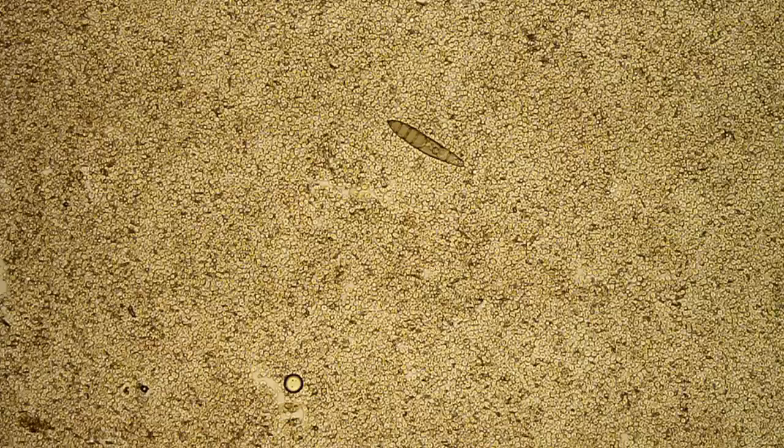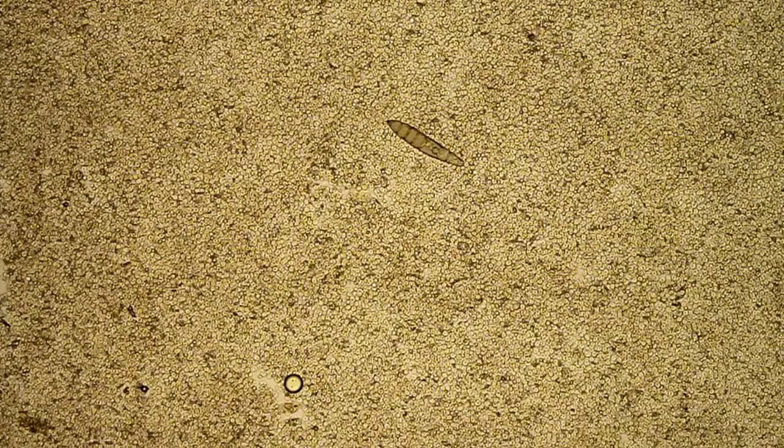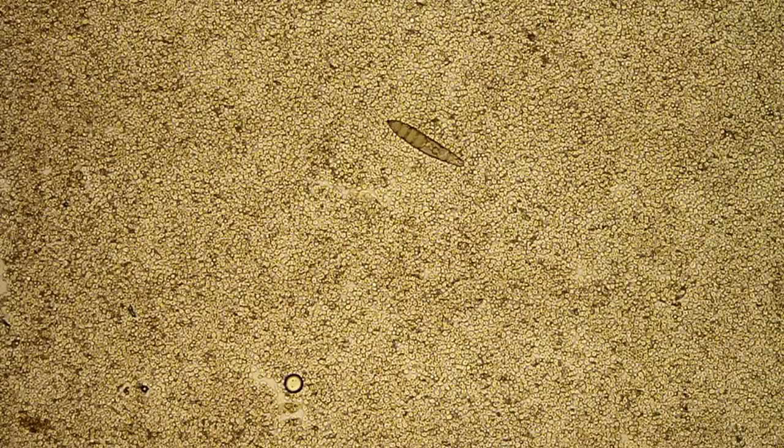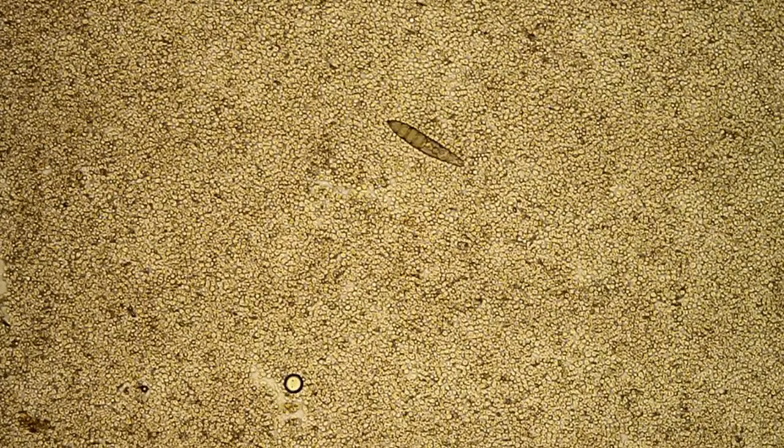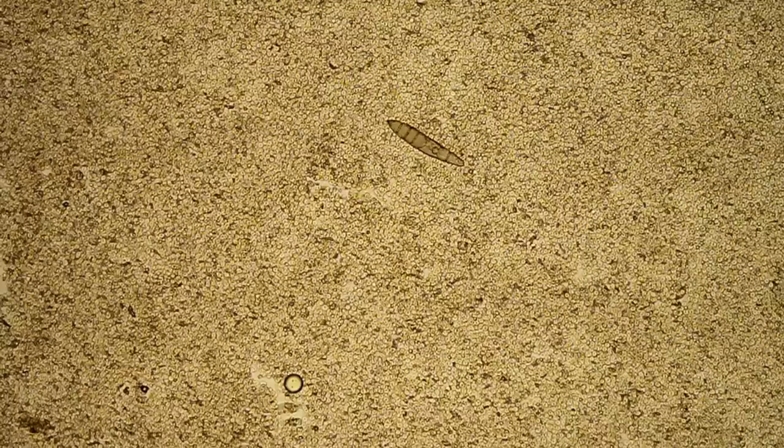See the blood is still moving. I don't know what that is. Okay, let's go to a Nikon E40 objective lens that I've got here.